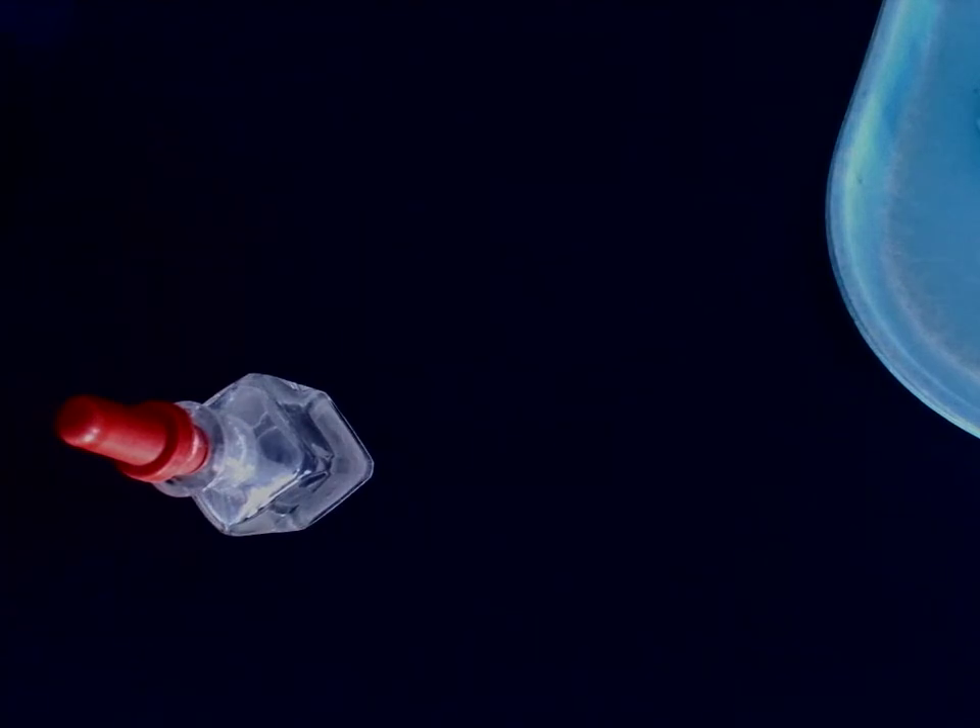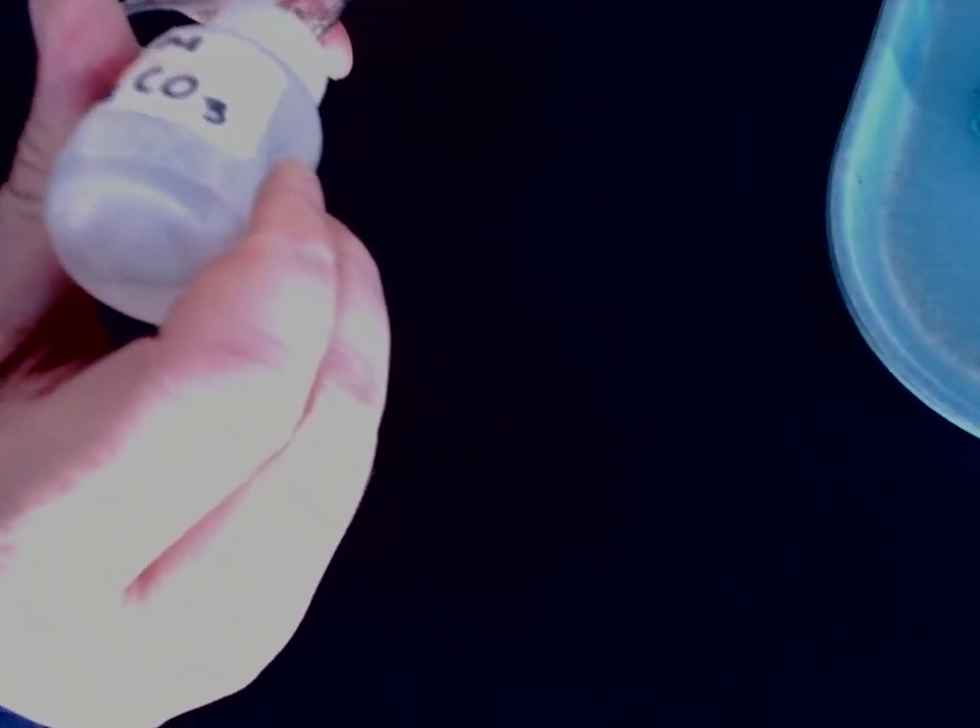Next up is sodium carbonate with zinc nitrate.